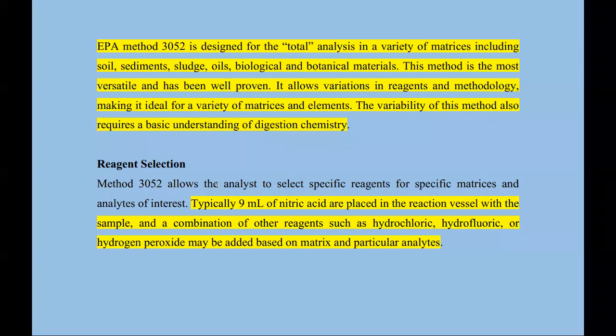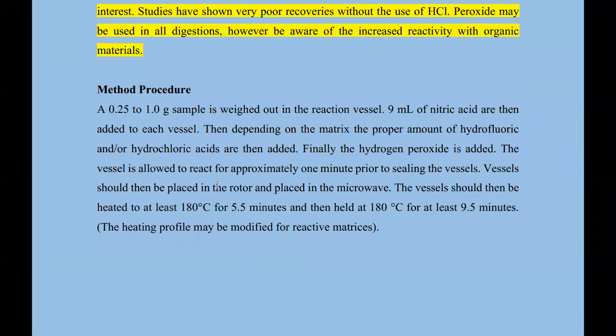Okay, so these are methods and how it's done. I think that's where we can end for today. I'm going to give you a summary. It is important that when you're choosing the method to use, one, consider the composition of that element.